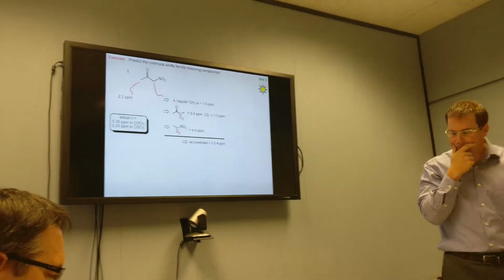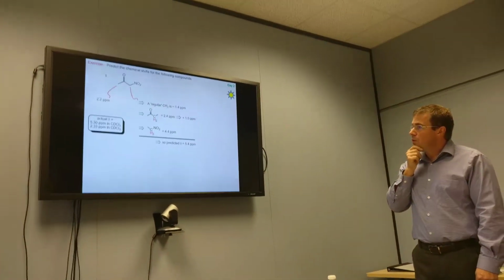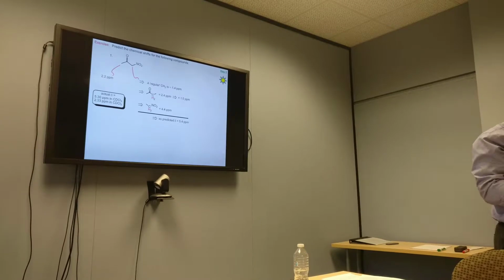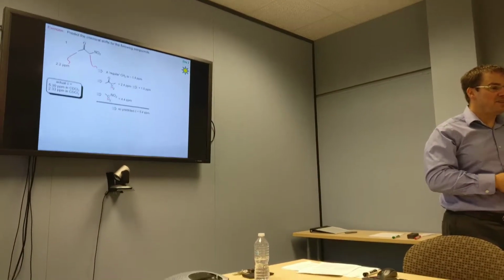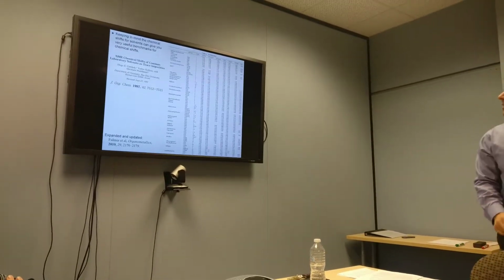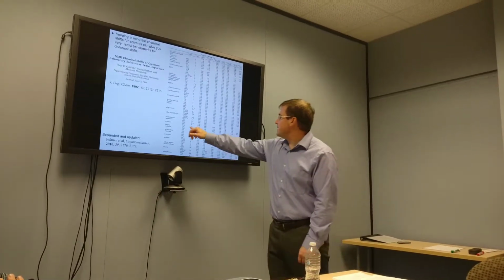Okay. What about the methylene in the middle? Well, if you think of your common NMR impurities, hexanes is one of them. Right? Hexane and ethyl acetate you use to run your column, so you know where the ethyl acetate appears. You should also have an idea of where the hexanes appears. Okay, so let's just go and look at that. So here's n-hexane.